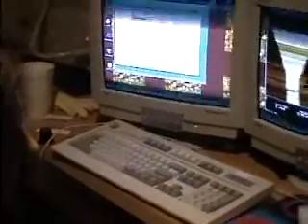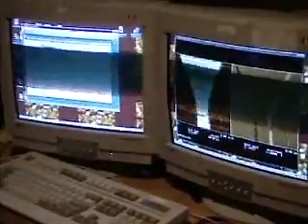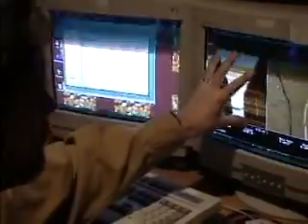So most of the time it is necessary to go from this type of image, which is the full plane subtracted image, to the line by line version subtracted in order to get rid of this streakiness that's associated with tip changes. In order to do that, first I have to select either the left image or the right image.